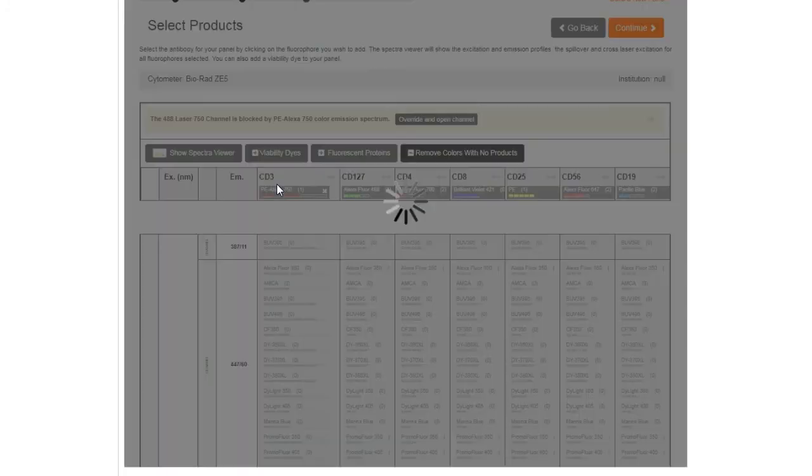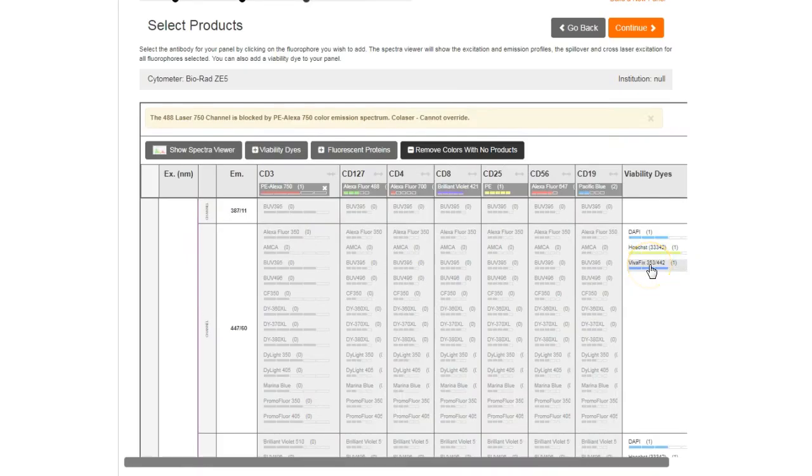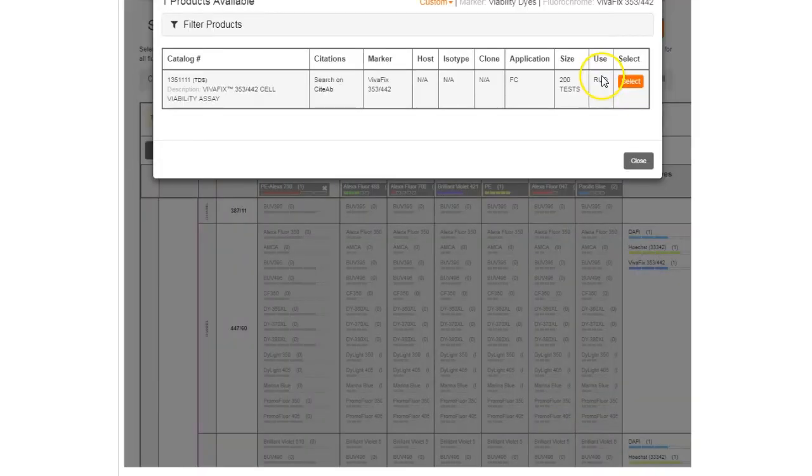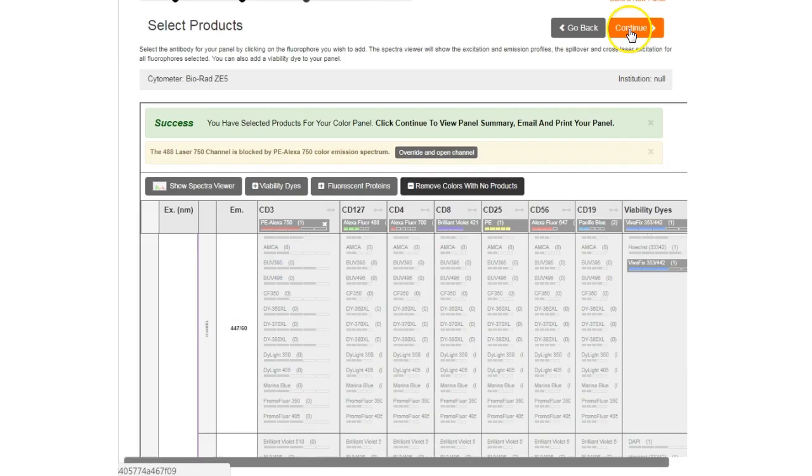Select a compatible live dead marker to add it to your panel. Use of a viability dye will help optimize your staining by removing dead cells which bind antibodies nonspecifically.